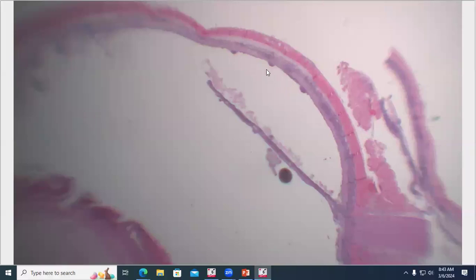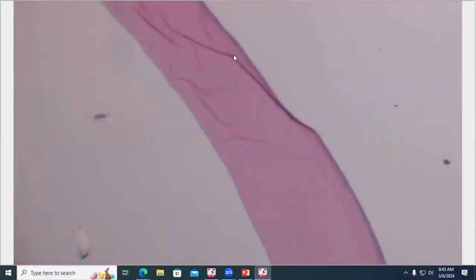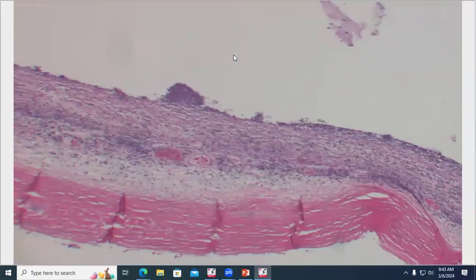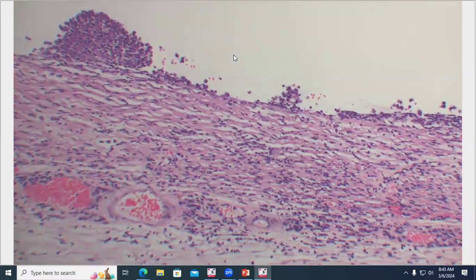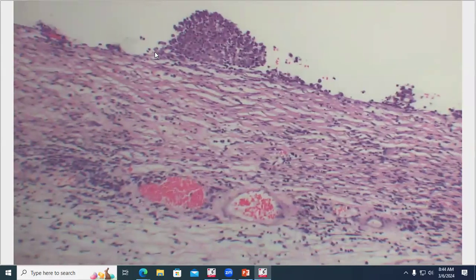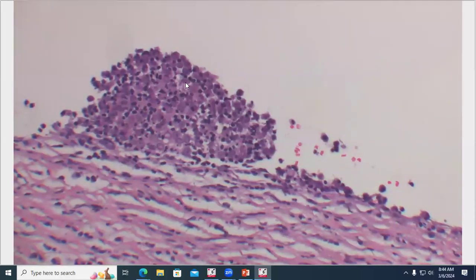And you can even see these sort of multifocal raised areas in the choroid. And we can take a closer look at what those guys are. So now the cornea is on our right, so it's flipped, but here we are in the back. And we can see that there's a really thick epichoroidal membrane. So I'd say that the choroid itself ends maybe like here-ish, and then everything on top is basically fibrovascular to collagenous membrane. And then those little raised foci are indeed essentially pyogranulomas, or at least just clusters of macrophages and neutrophils. So here those are.